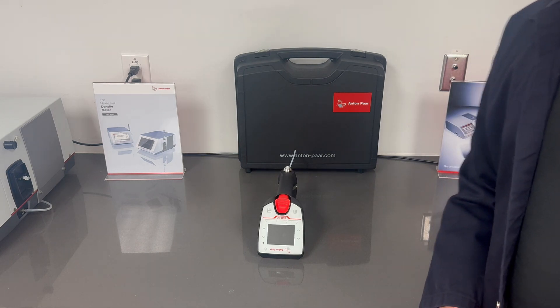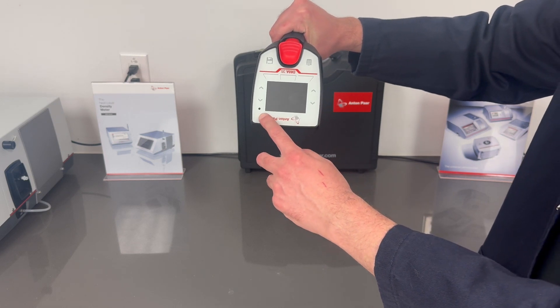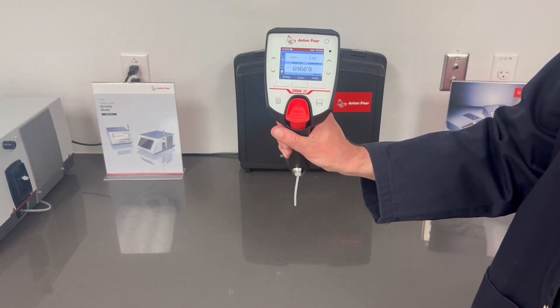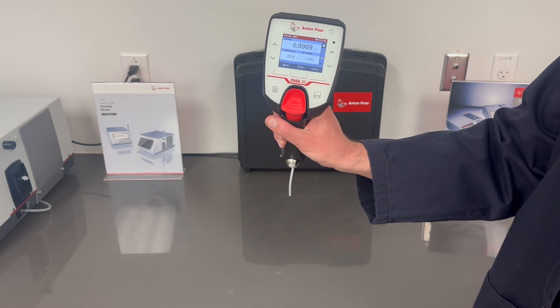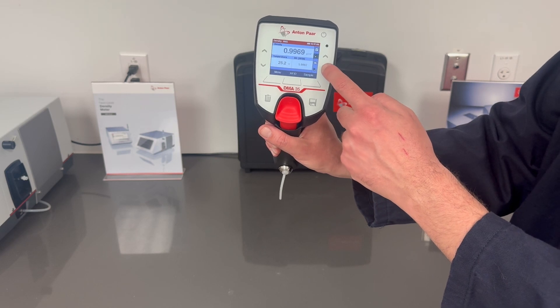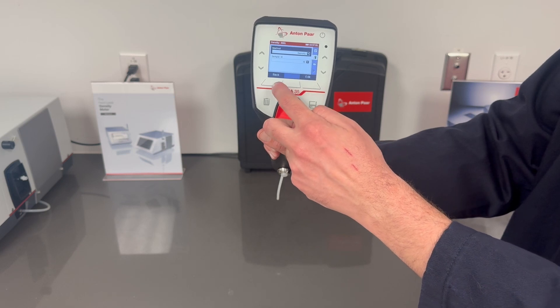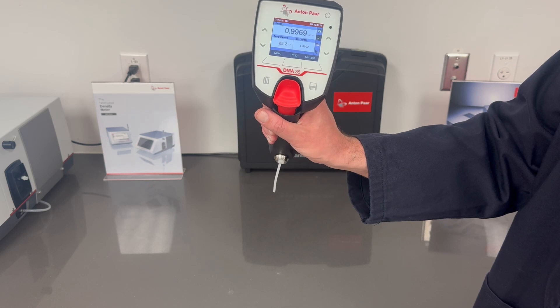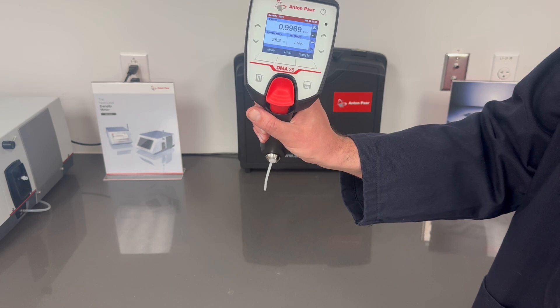Let's start by powering on the DMA35. The interface is easy to use — touch the keys to navigate the menus, access measurement modes, and change settings. It can be used left or right-handed. You can also link a wireless printer and export results using Bluetooth for perfectly traceable results in regulated environments.